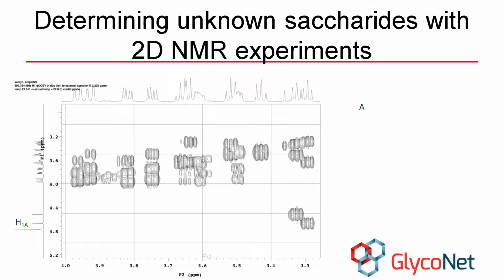Having identified which peaks belong to which monosaccharide, we can turn to the COSY to definitively assign chemical shifts to each proton present. If we start with the monosaccharide that I have labeled as A, we can walk along the backbone, identifying protons one at a time. Ideally, in a COSY spectrum, each proton peak should have a discernible cross peak for each neighboring hydrogen. However, sometimes the cross peaks are unclear or hard to distinguish. We will begin by drawing our diagonal line, which is shown here in black.